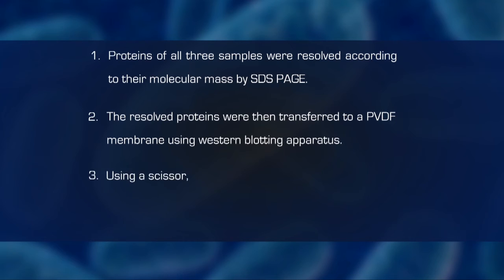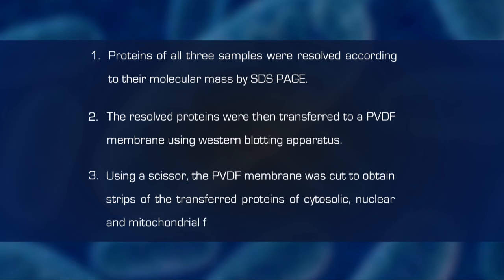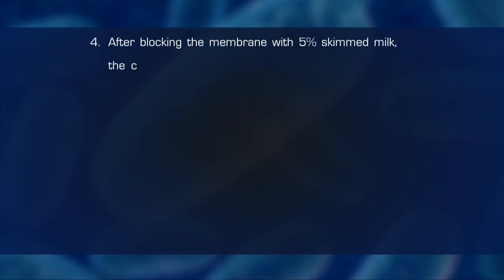Next, using a scissor, the PVDF membrane was cut to obtain strips of the transferred proteins of cytosolic, nuclear, and mitochondrial fractions separately.